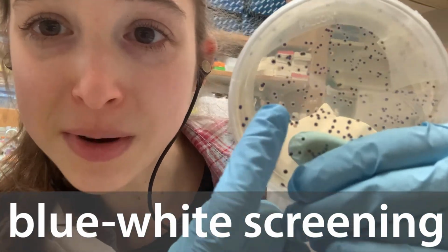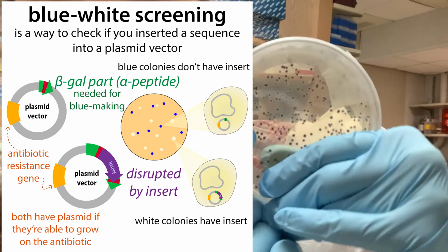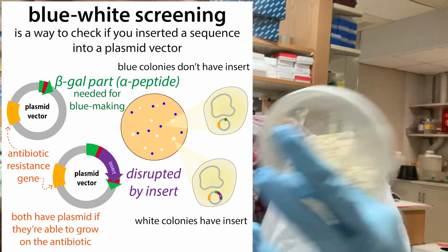Some of these clones are too, but not these white ones, which tells me that the bacteria in this colony, in this dot, have taken in the gene that I want them to take.